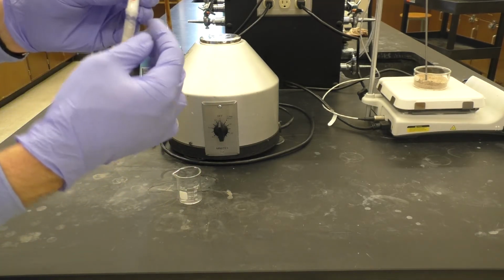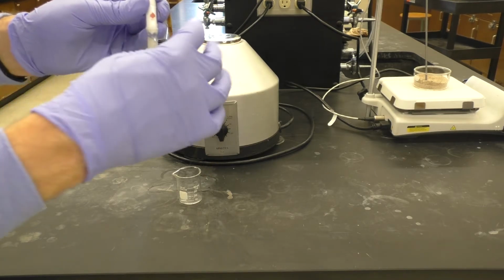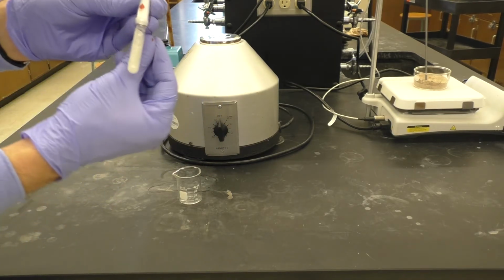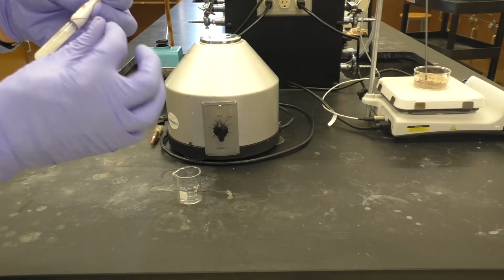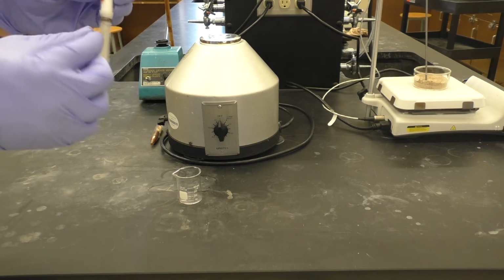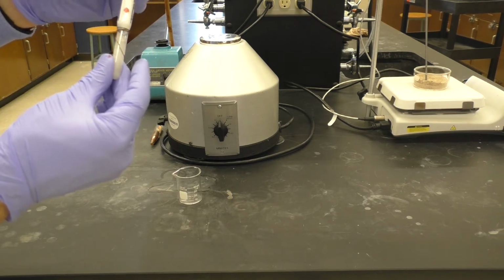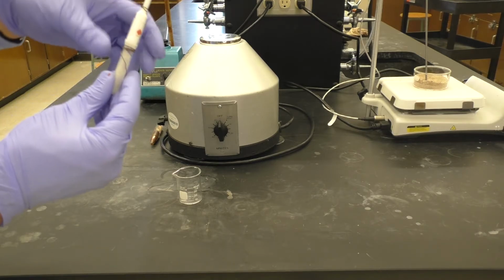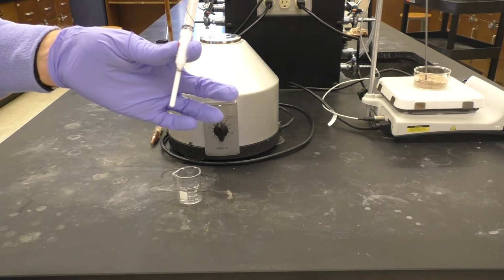I'm going to run that down to the little bit of a lip here for the Craig tube. So if I wrap it around the lip of the Craig tube, that simply now will hold everything together, and then I'm just going to wrap it a few more times to get rid of the excess copper wire. Now, my two pieces are held together, and I can actually invert the system here without any changes.